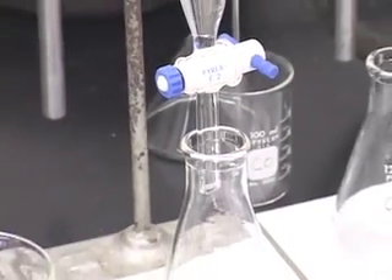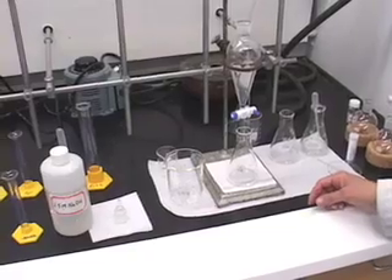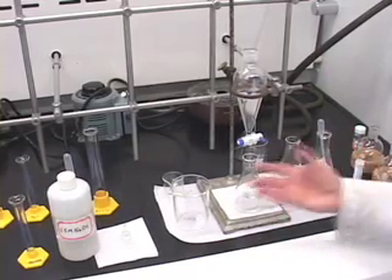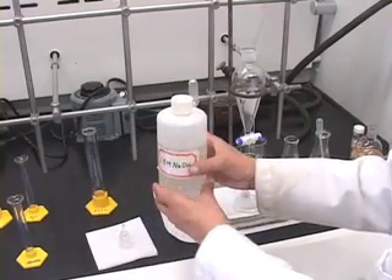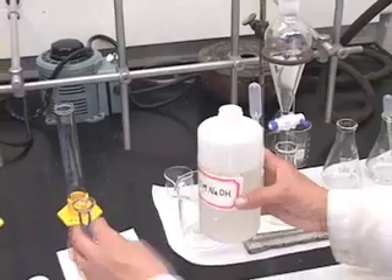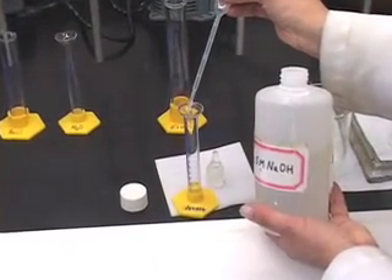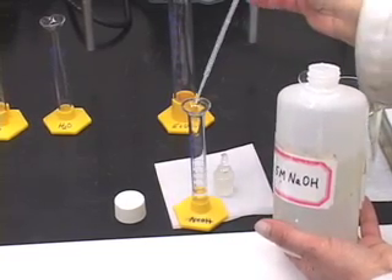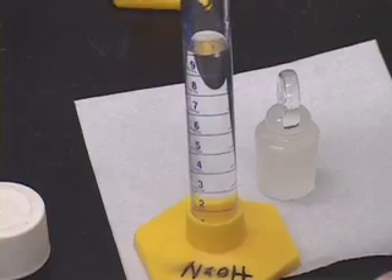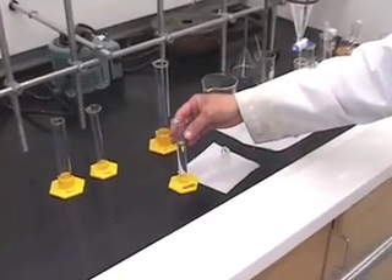Now I am ready to do the second extraction with sodium hydroxide again. Remember, we said you should extract twice with sodium hydroxide — that is what is meant by extraction with sodium hydroxide twice. So I am going to take another 10 mL portion of sodium hydroxide.